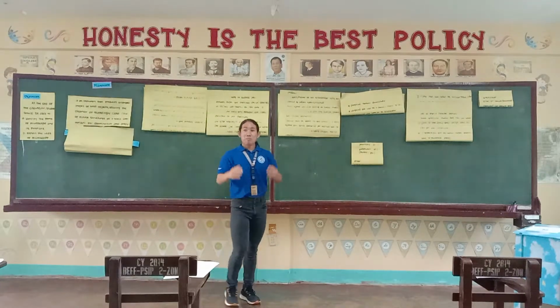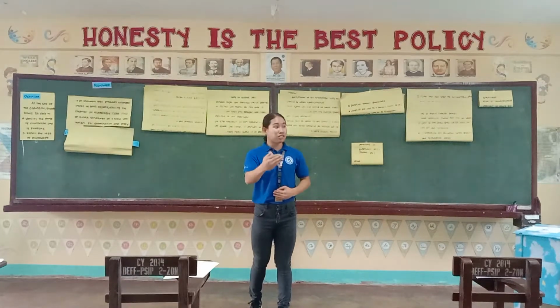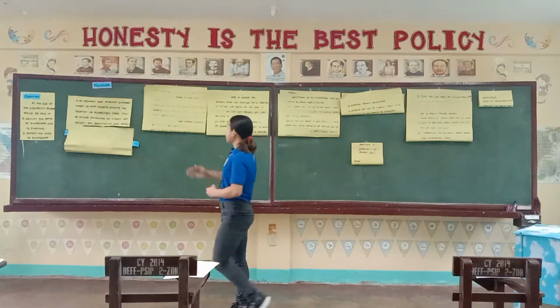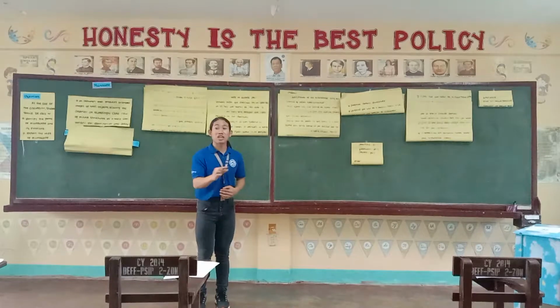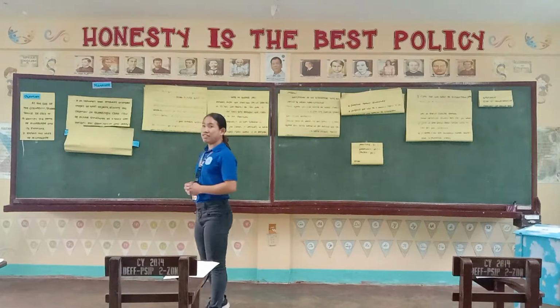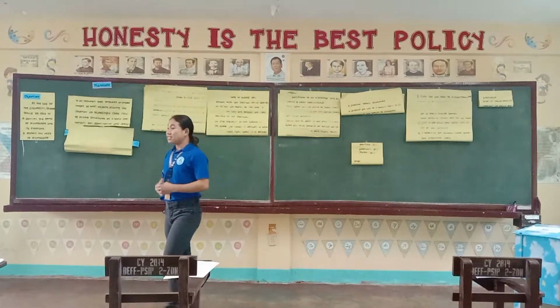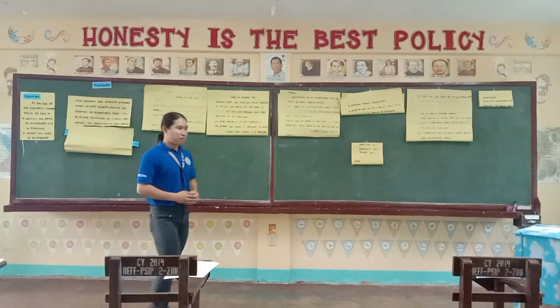Meaning to say, a microscope is an instrument used to study certain parts and structures of a cell because it can give a close view of minute structures of a very small or tiny part of a cell. So, we already know the meaning of the microscope.